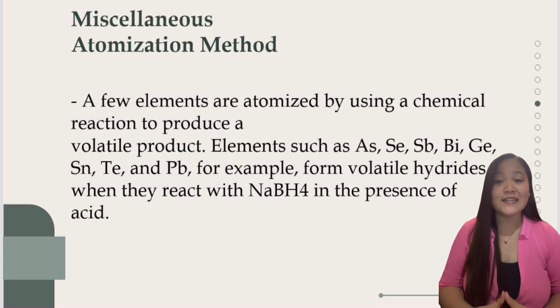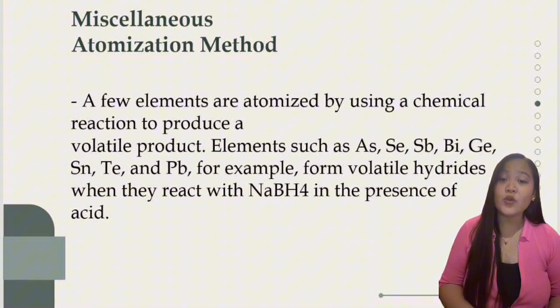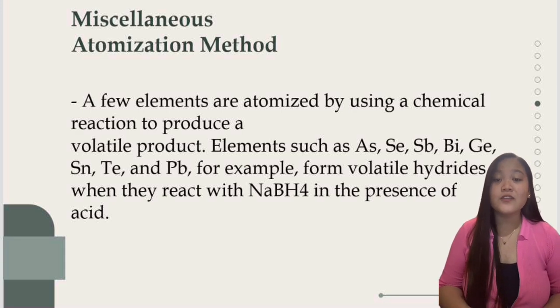So by using a clever chemical reaction, we can turn these tricky elements into cooperative hydrides, separate them as a gas, and then break them apart to see them as single atoms, ready for further analysis.